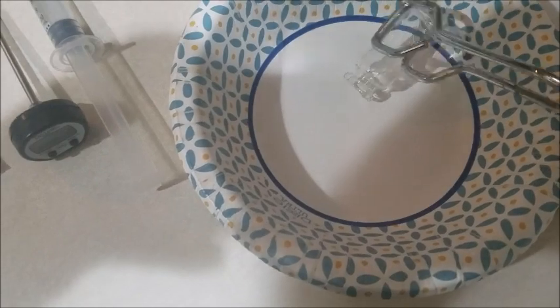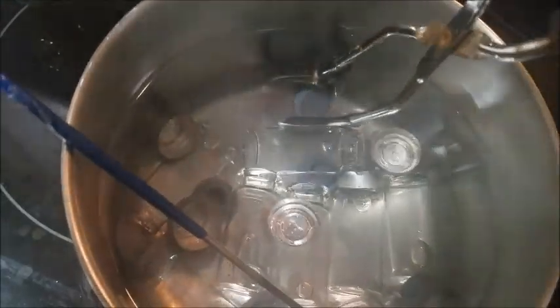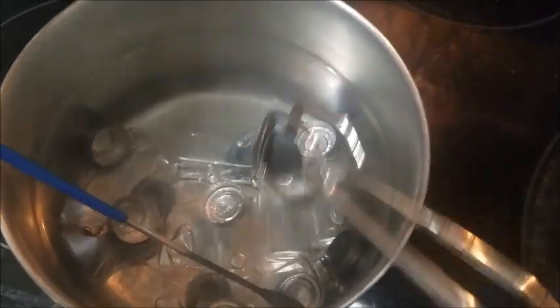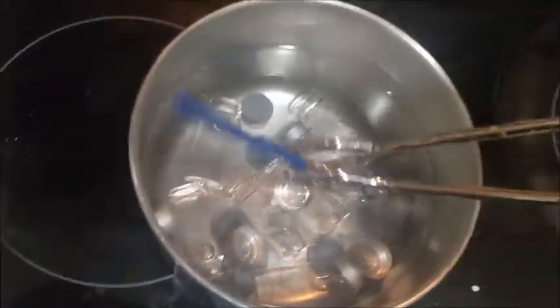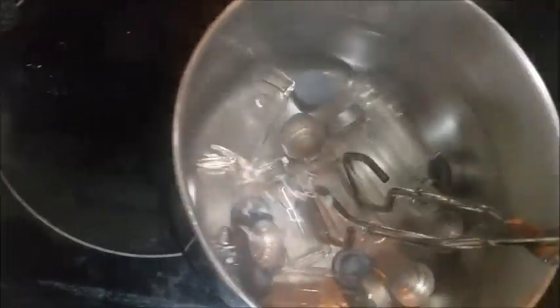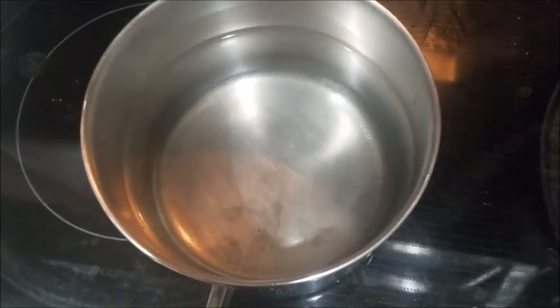After that's done, we're going to carefully transfer it over here. We're going to turn it right side up, as well as we're going to get ourselves a cap and a lid out of here. We can also grab this micro spoon and set this to the side. Now, since I'm going to reuse this exact same pot of boiling water, I'm going to go ahead and take the rest of these out of here. Alright, you can see I've taken all the vials out. Now we're going to start our second step.